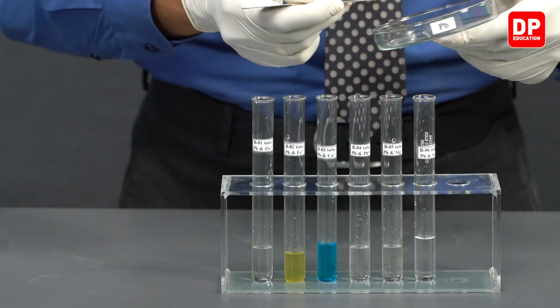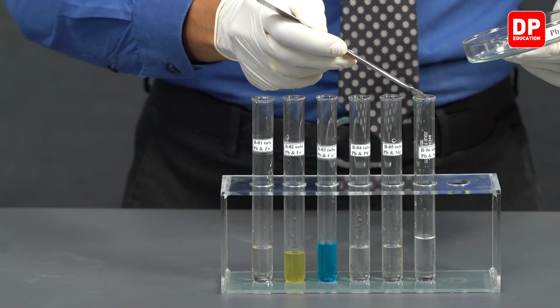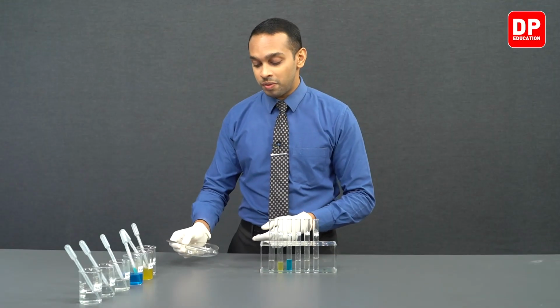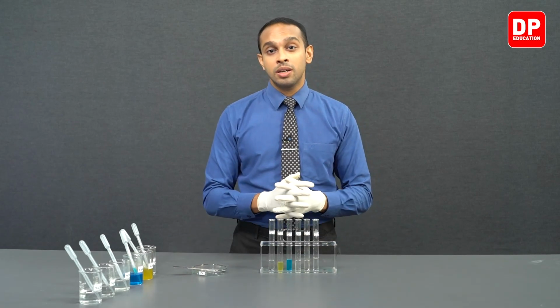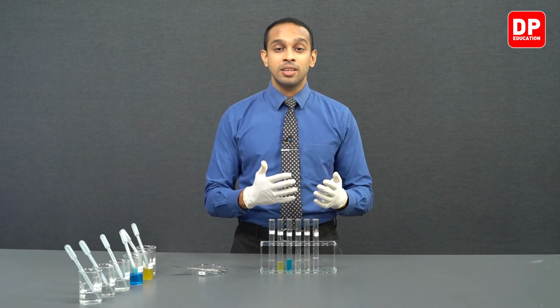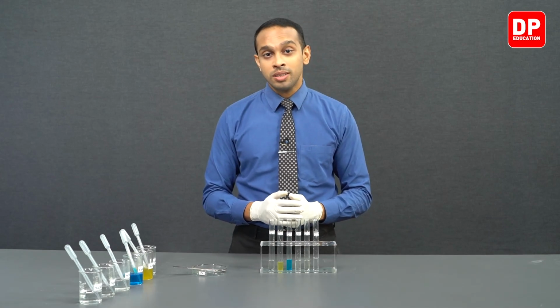As you can see, lead metal sinks easily to the bottom of each test tube. Unlike copper, we observed copper did not easily sink to the bottom of the test tube when we added copper metal in the previous experiment. Copper was made into thin sheets and we had cut it into small pieces. Since copper was somewhat lighter, it was floating on the surface of the water due to surface tension of water. However, when you mixed it, due to the weight of copper, it sank to the bottom of the test tube.